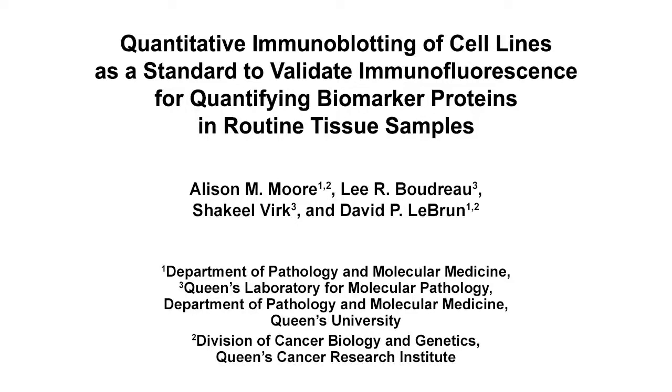This method can help answer key questions in the field of cancer pathology by quantifying biomarker proteins from routinely processed biopsy material. The main advantages of this technique in relation to conventional immunohistochemistry are that it is objective, has a wide dynamic range, and permits the quantification of proteins in specific cell types.